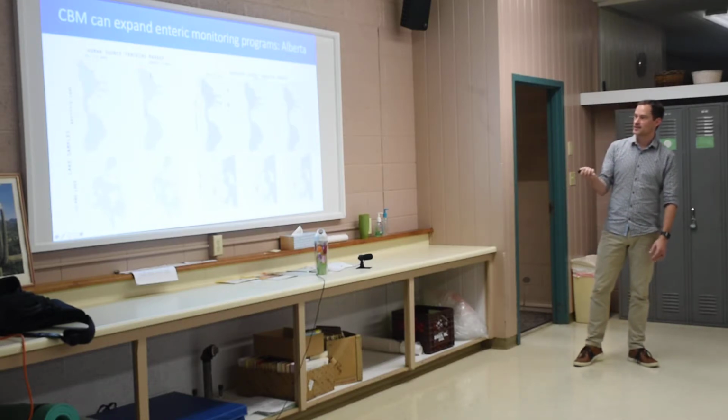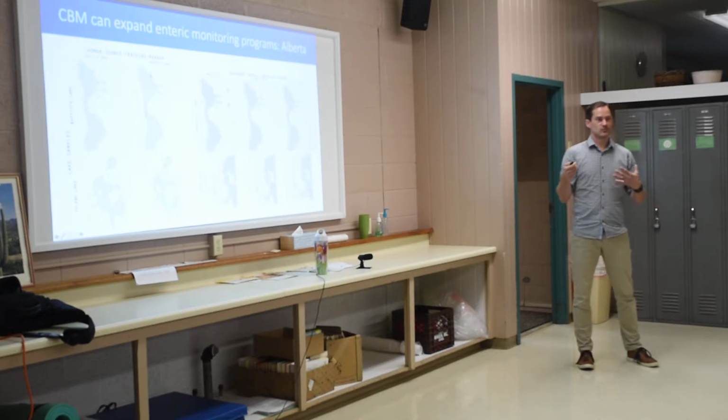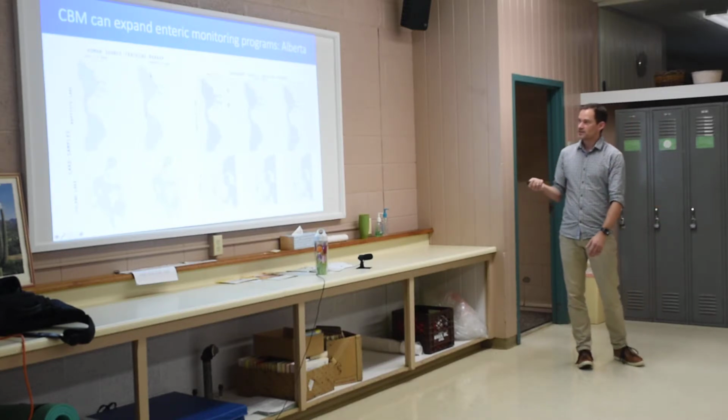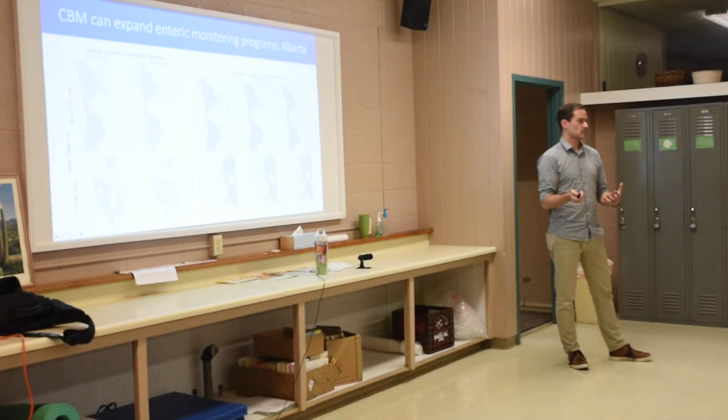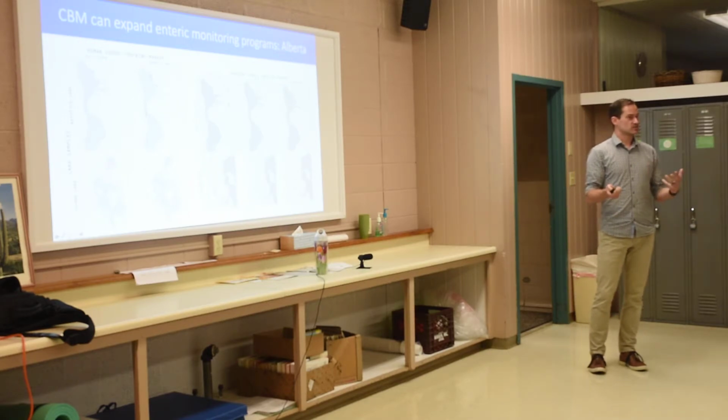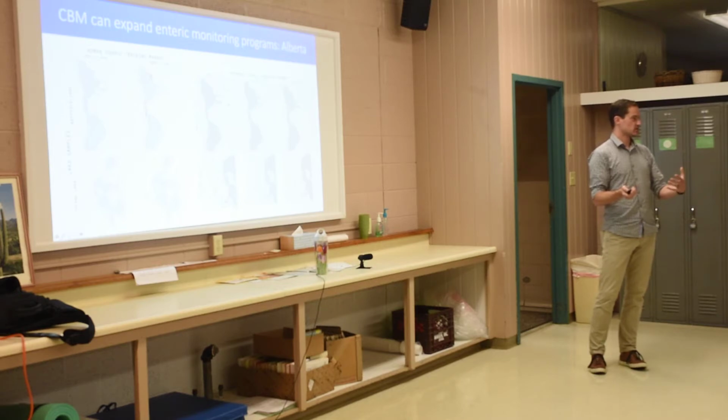There's no way that this lake would do this on their own because just to give you a sense, in Alberta, if you were to contract qPCR testing, it's about $300 a sample to do contract qPCR testing. And then it's about another $50 per every additional test that you add off of that sample. So $300 for the initial qPCR test and then $50 for every other test.